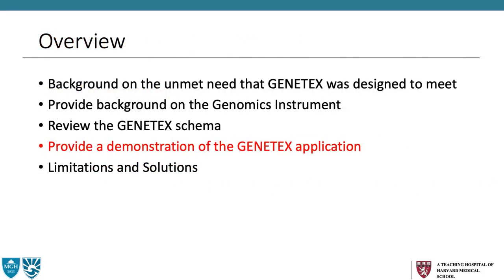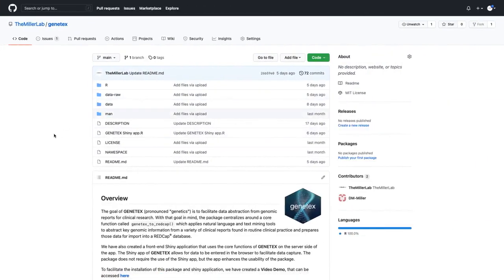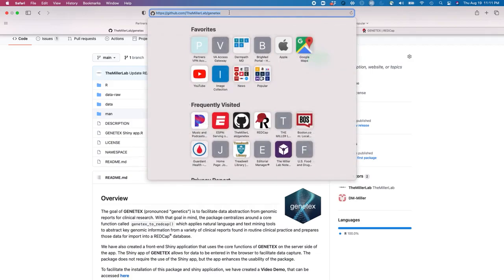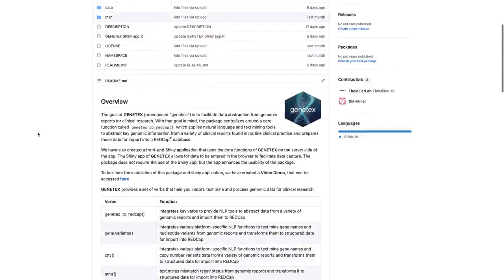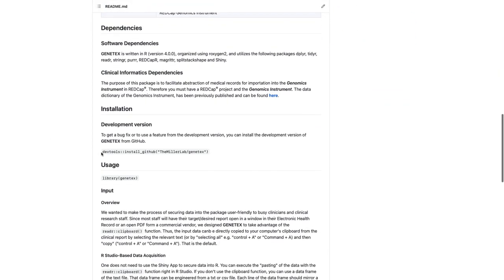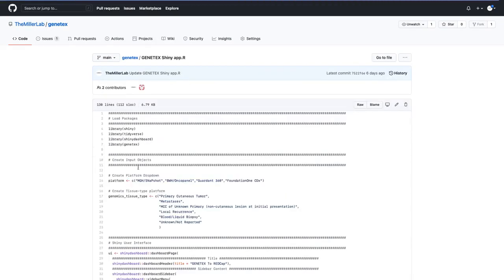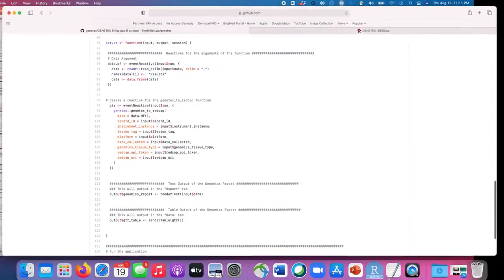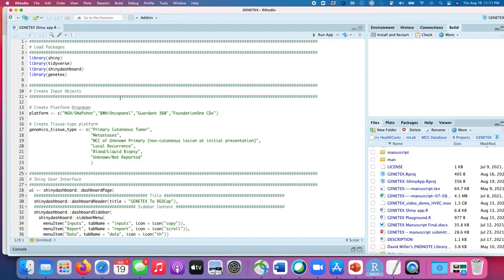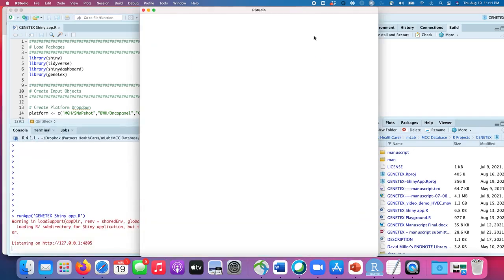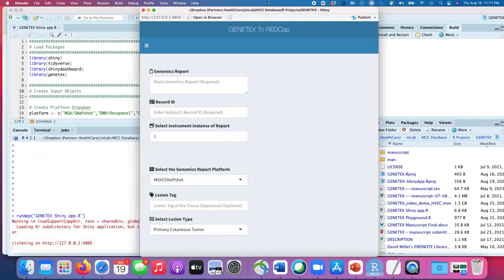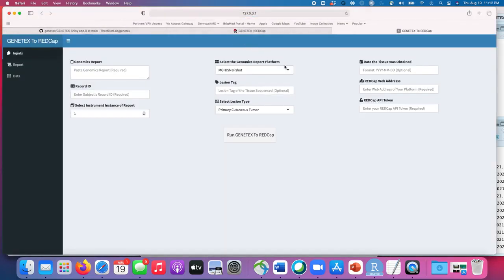Now let's provide a demonstration of the Genetix application. First, we'll show you how to install it — it's available at our GitHub repository, the Miller Lab slash Genetix, where we provide a readme page that gives an overview and the code to install using the devtools package. On the repository, we also have the code for the Shiny application, which you can copy and paste into an RStudio project. Then you can run this code, which will pull up a web browser with the Genetix application.